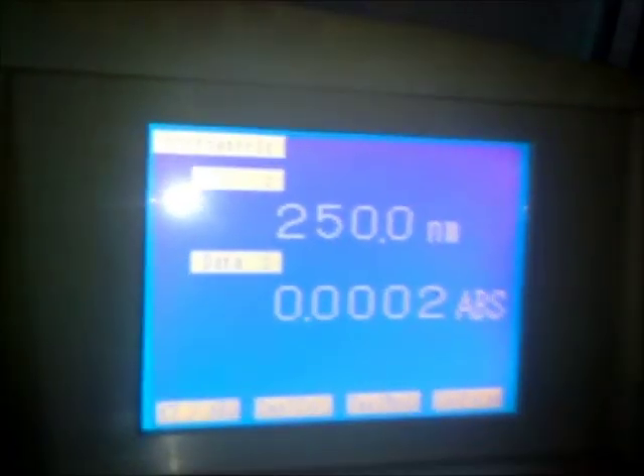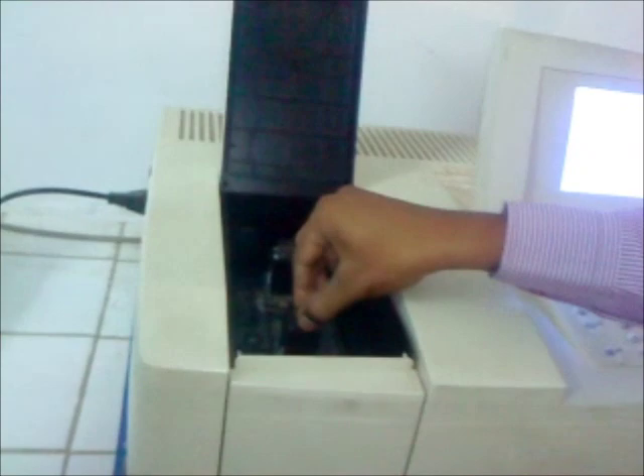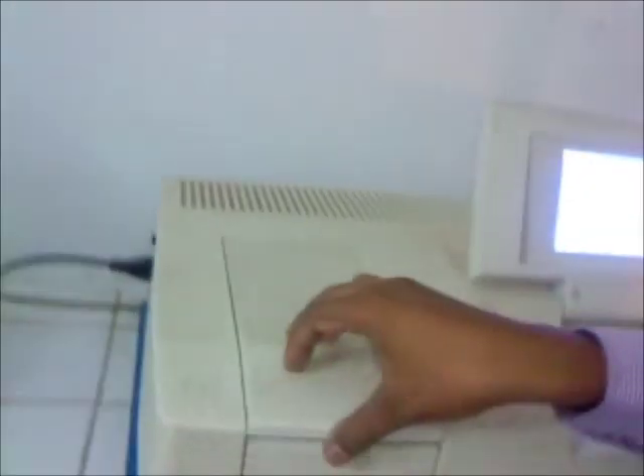The absorbance is now 0. One cuvette is removed — the previous cuvette with blank is removed — and in that cuvette we add the sample one by one. This is the sample-containing cuvette; place this cuvette in the previous holder.